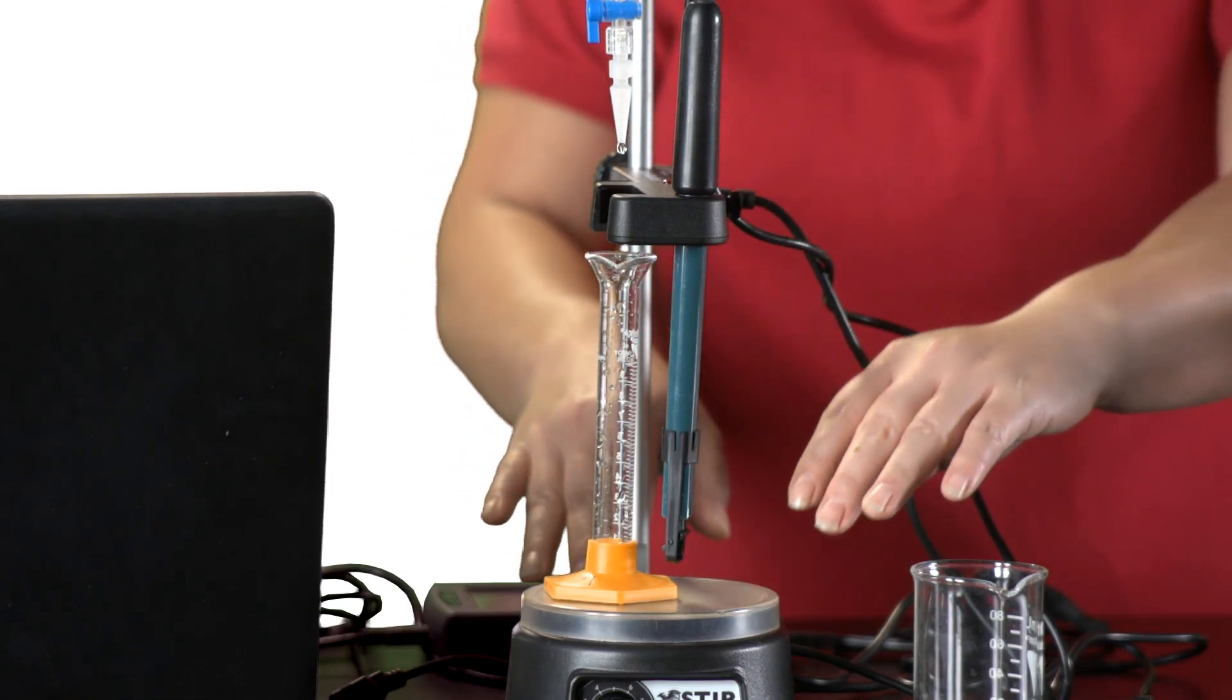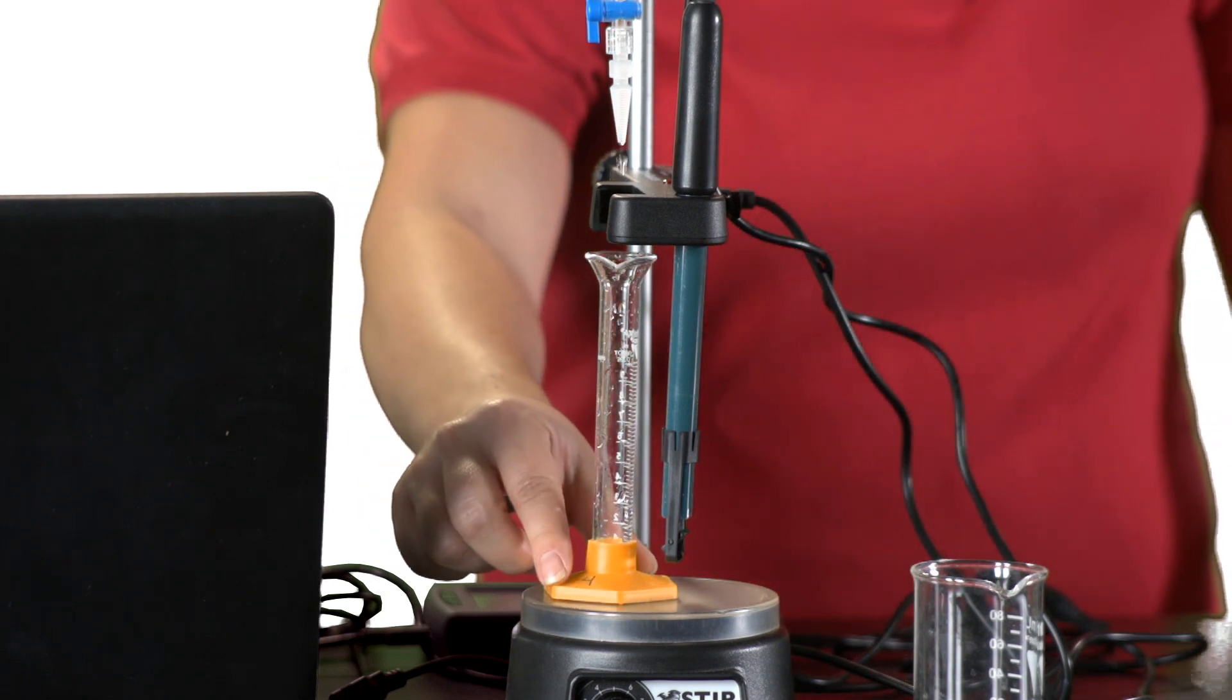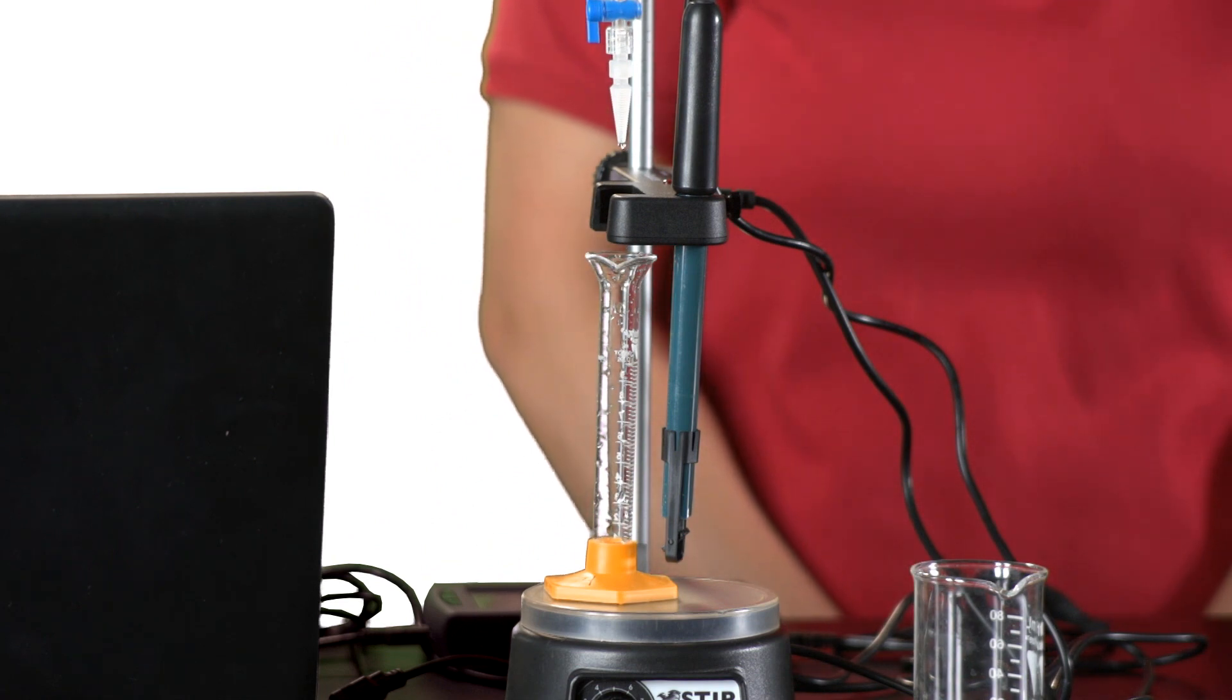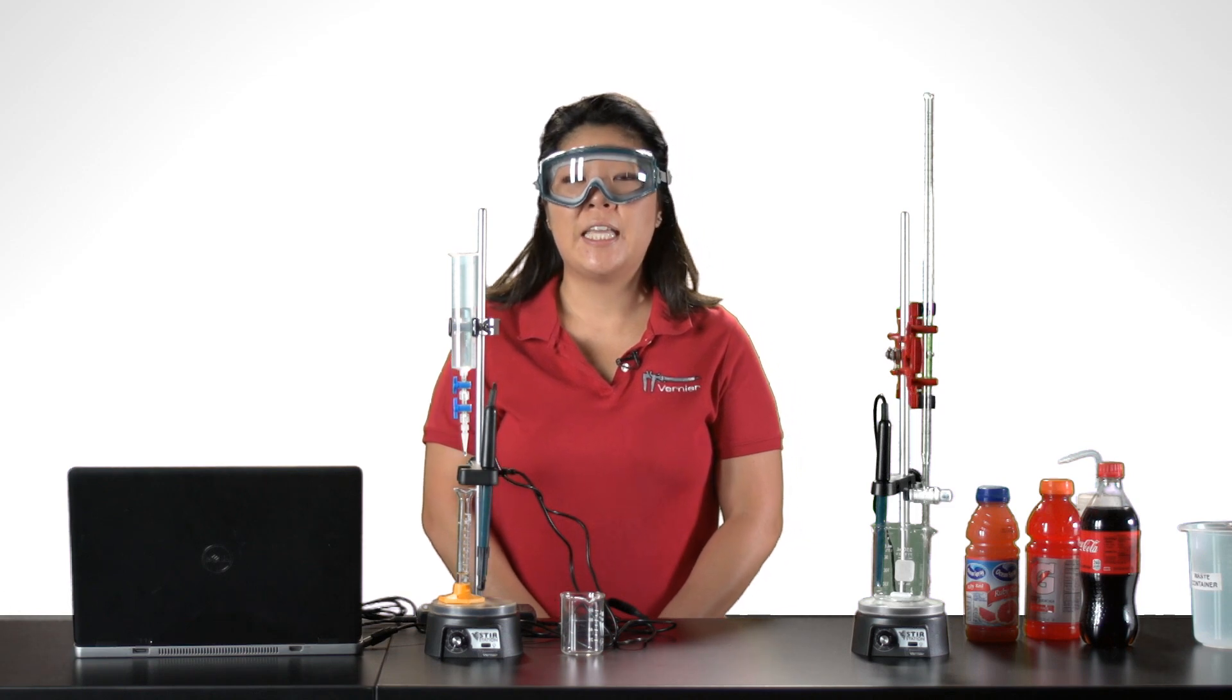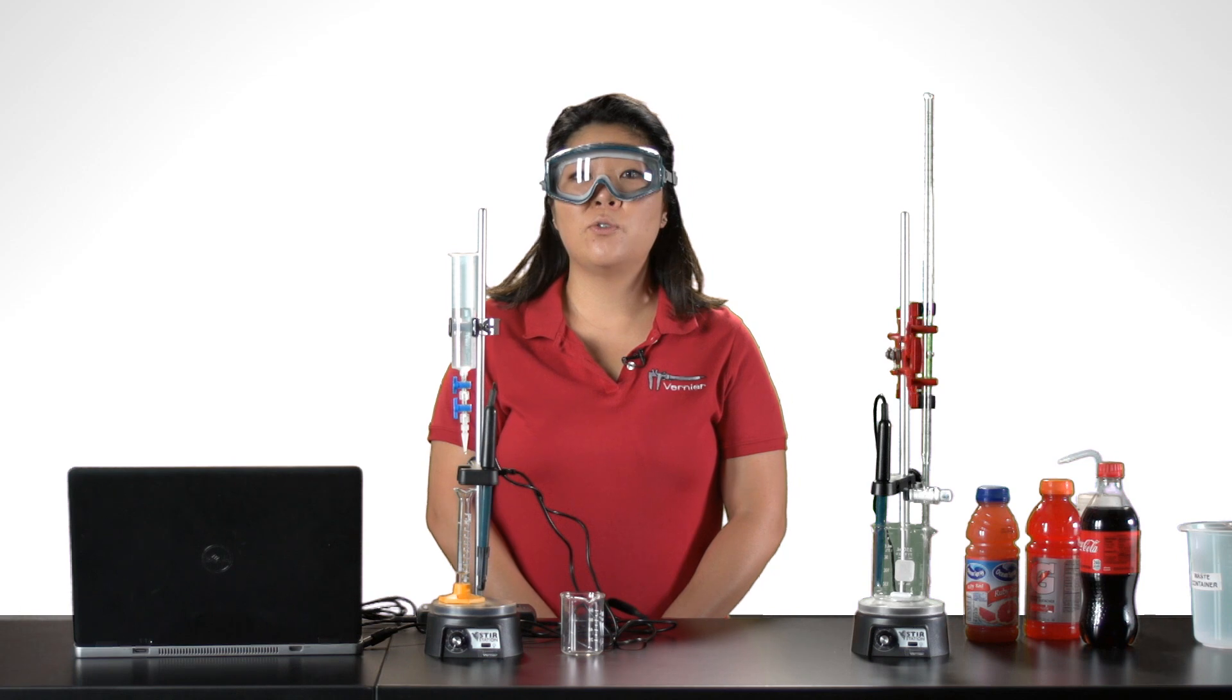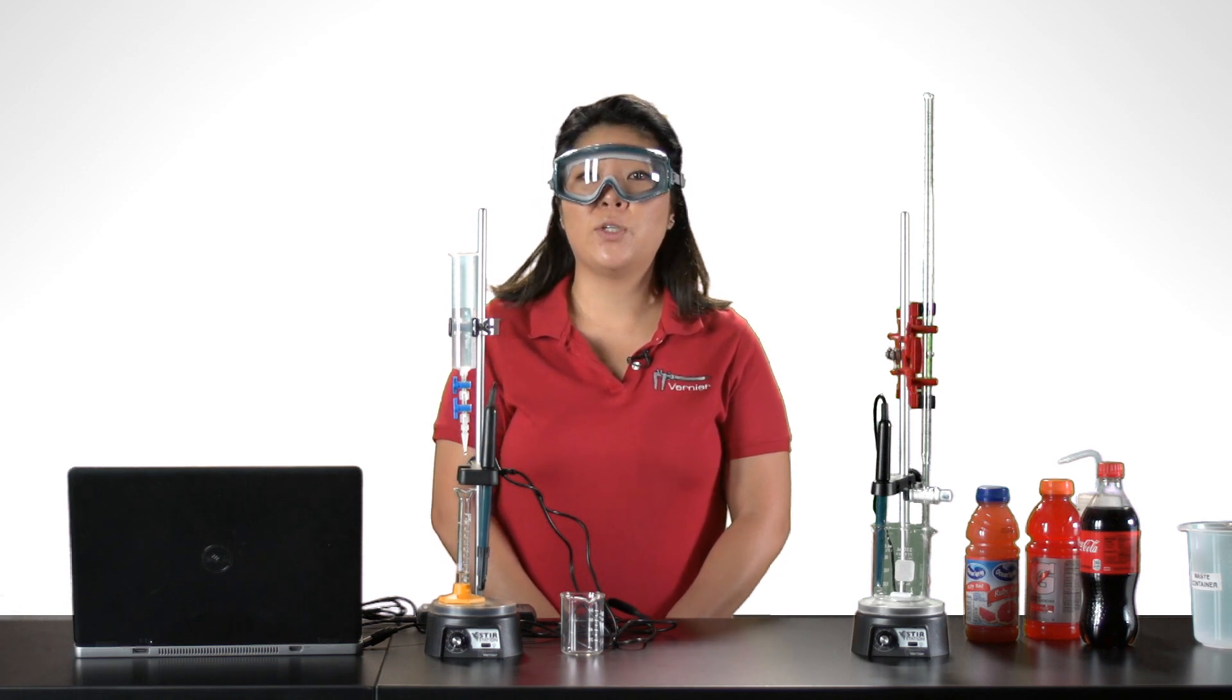So I've readjusted the setup here now to calibrate the drop counter using a 10 milliliter graduated cylinder, making sure again the drop rate is no faster than approximately one drop for every one to two seconds. The intent is to collect approximately nine to 10 milliliters of liquid in the graduated cylinder, and the software calculates the drops per milliliter based on the number of drops counted and the manually entered volume.